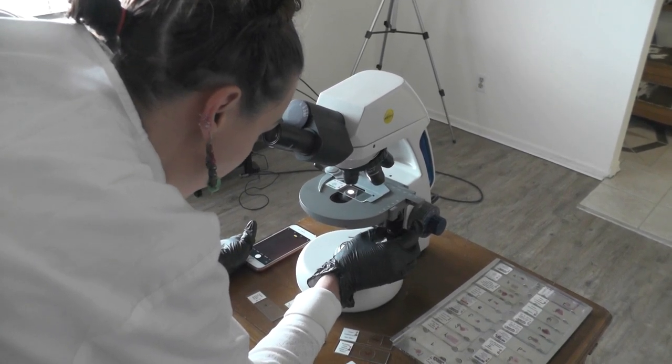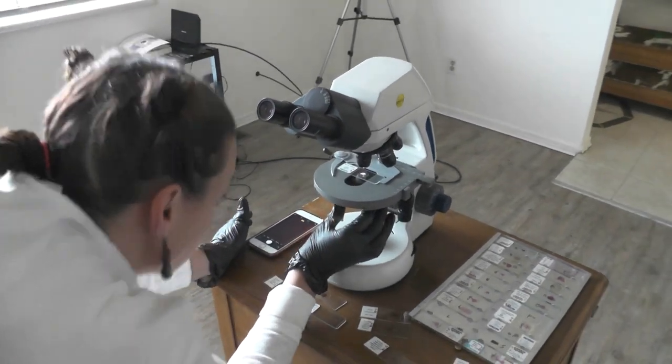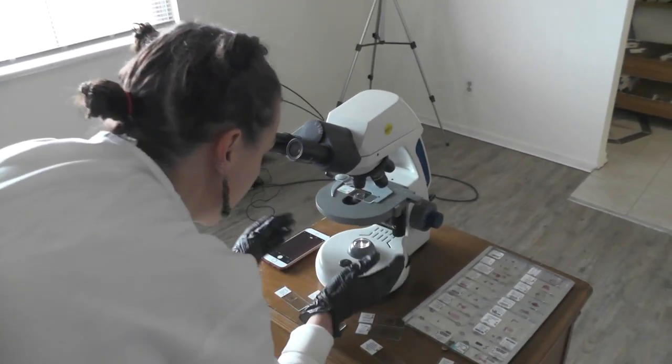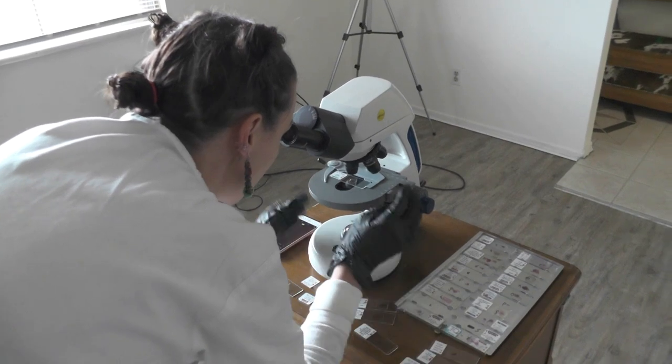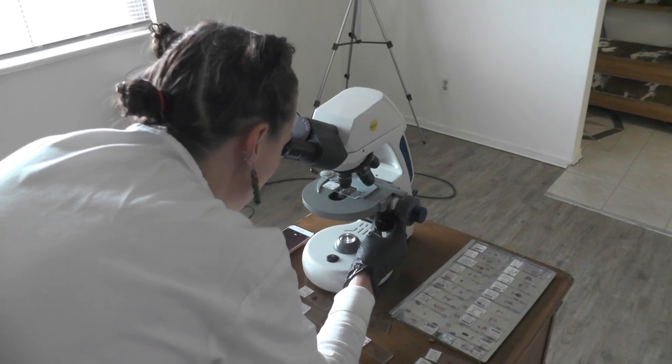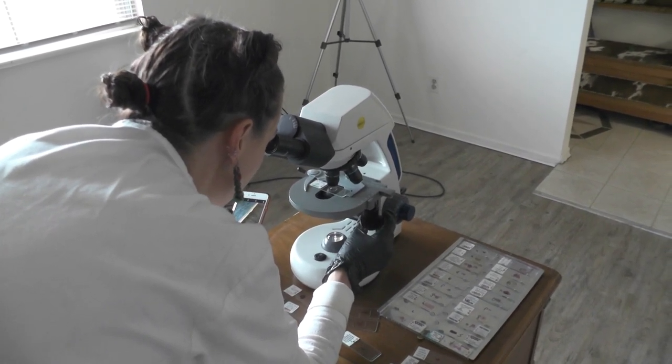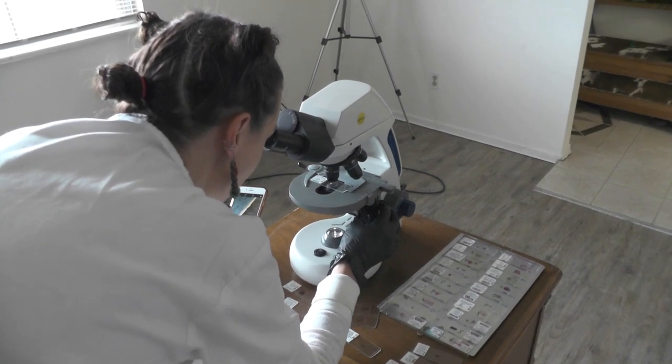Remember bile salts are going to be really important for the emulsification of fats so I actually need to make some adjustments here so that we can get in and see those triads. You can see that all of our lobules here in the liver are organized around central veins. I'm going to come out to the outside though and find us a portal triad.